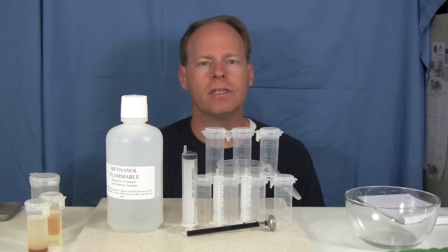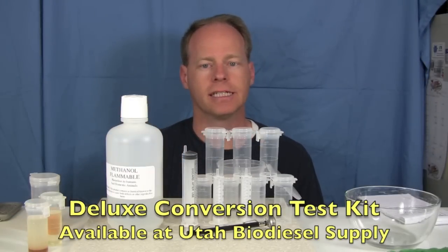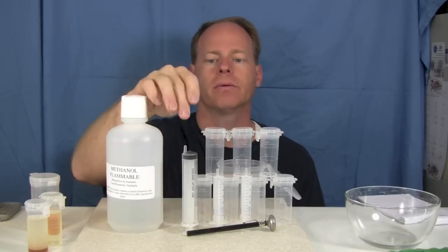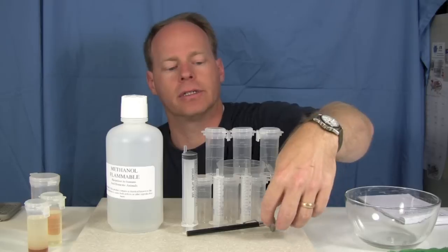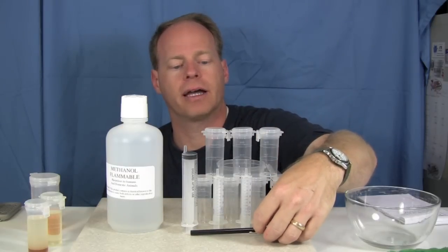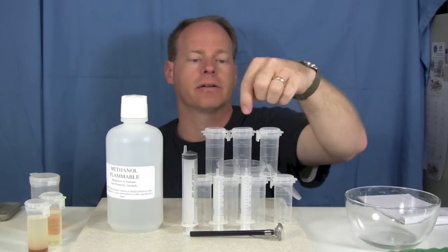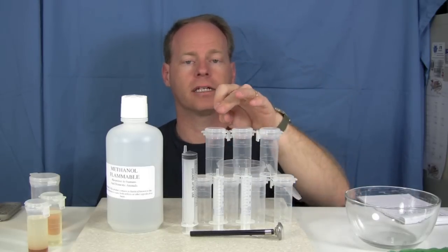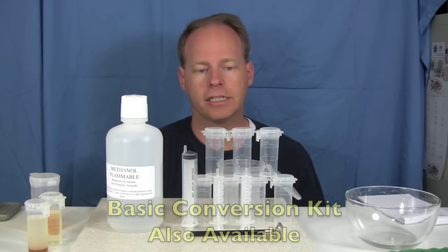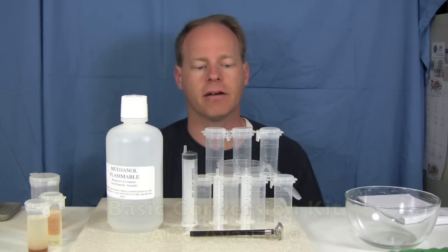So let's get started. Utah Biodiesel Supply sells a handy biodiesel conversion test called the Deluxe Conversion Test Kit. We have a bottle to put your methanol in, a 30 milliliter syringe, two 10 milliliter syringes, a temperature gauge to measure your biodiesel and methanol, and several vials to do this test in. We're actually going to do the test in this. We also have a basic one, which is just three vials and a couple syringes.